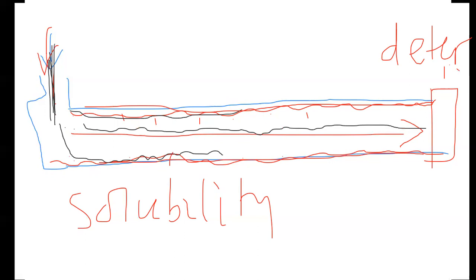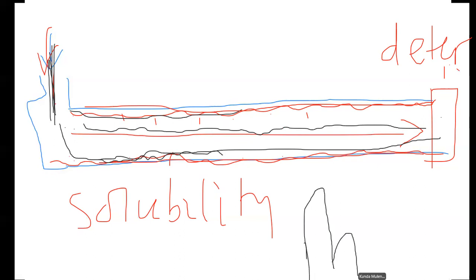Well, these guys that are busy greeting people everywhere, by the time they reach here, me, I've already gotten there. So you can have one peak for the one that arrived first, and then the other one for the one that arrived later. Then you're able to interpret the magnitude of the peaks, the height, and all that.